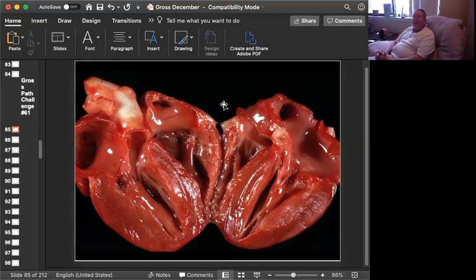It's easy if you weigh the heart. Generally, I use 20 grams as cutoff for a normal heart. Anything above 20 grams, I start to think about hypertrophic cardiomyopathy. One of our own personal cats had this and died a year ago with a heart weight of 27 grams. And you can get the same weight on formalin-fixed tissue. Just make sure that you trim off all of the pericardium and anything else. Cut the great vessels pretty close down so you get an accurate weight.